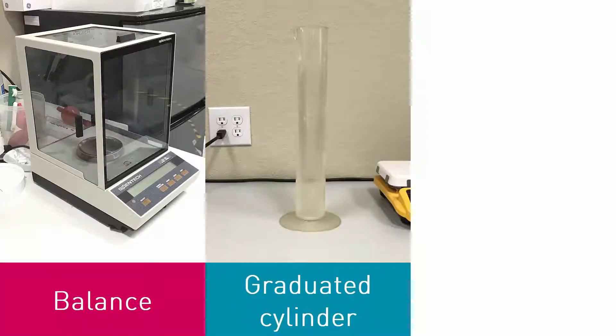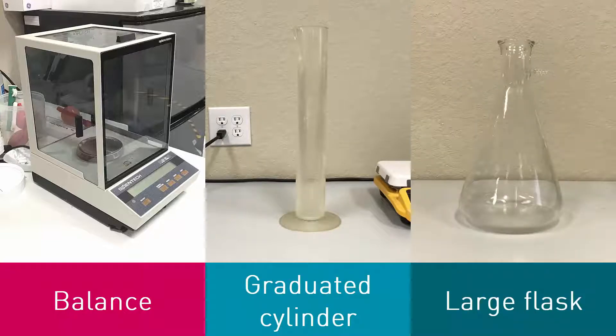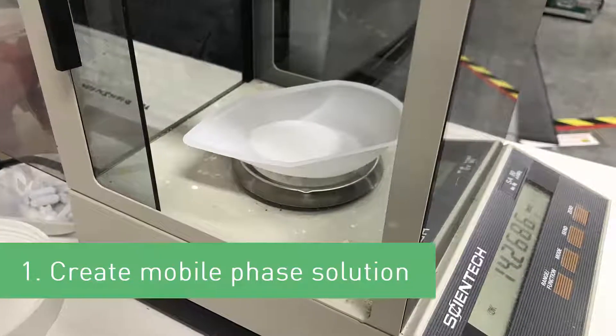Other lab items that might be helpful are a balance to weigh out any added salts, a large graduated cylinder to measure a known amount of solvent or additive, and a large flask for preparing the unfiltered solution. The first step is to create the mobile phase solution.